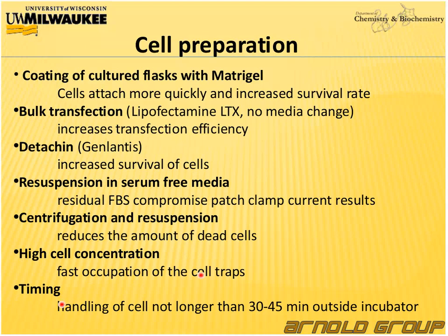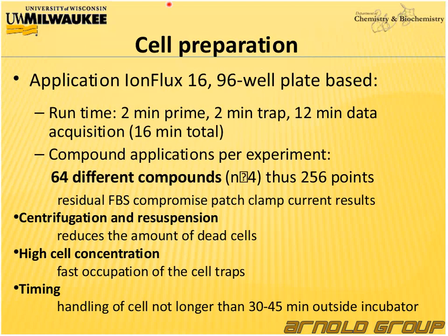Timing is also important here. We figured out that the whole protocol should be done in 30 minutes to make sure that the cells are still viable once we start the application.